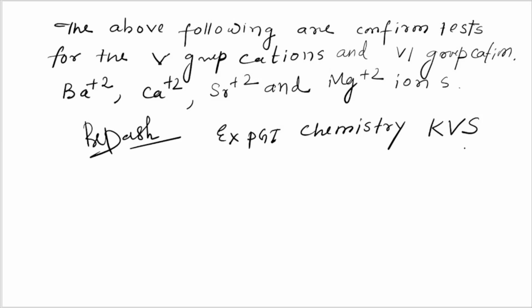The above are the confirmatory tests for fifth group cations and sixth group cations, that is Ba+2, Ca+2, Sr+2 and Mg+2 ions respectively.